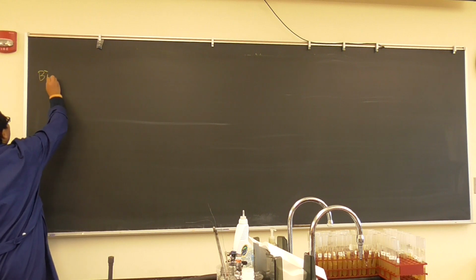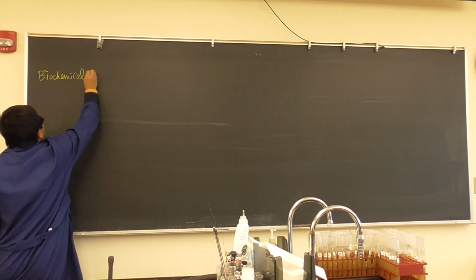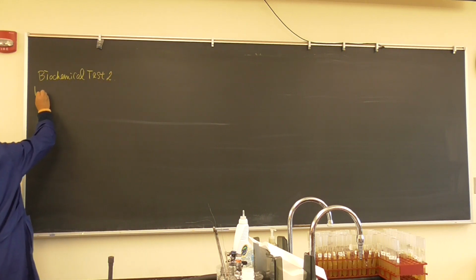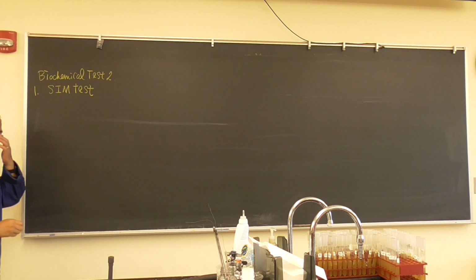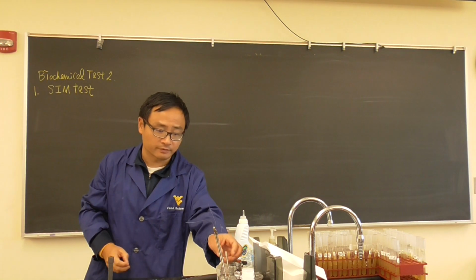So biochemistry test number 2. So the first test is the SIM test. Okay, this test is a little bit different from what we did before.